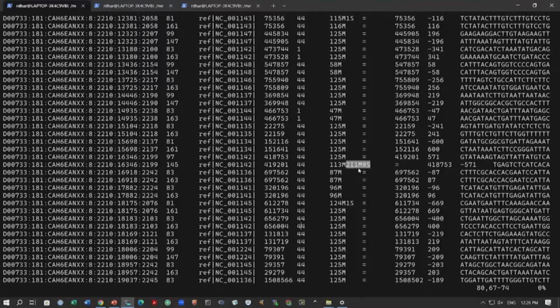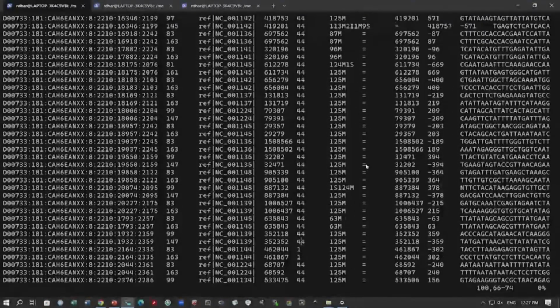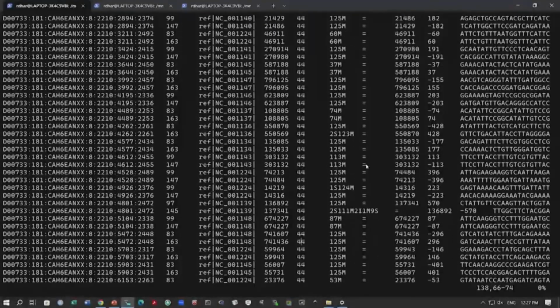These 2 insertions may not be real insertions, because you have this 9 soft clip, meaning these are not matching. The program could not find any match, so it is removing them. So, you would have to be a bit careful when you are dealing with read alignment. Maybe we can search for another example. I will search so that I can show you how it will look.